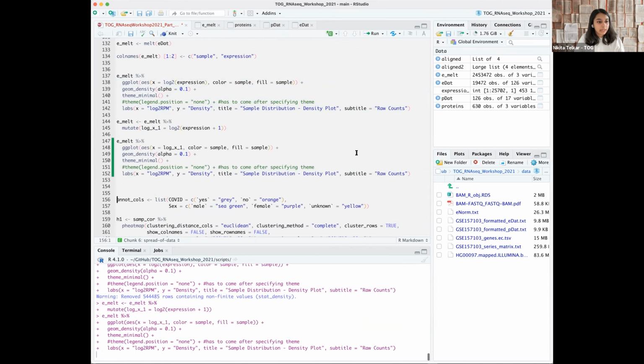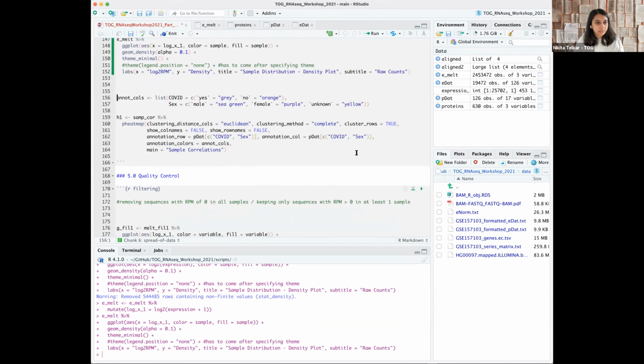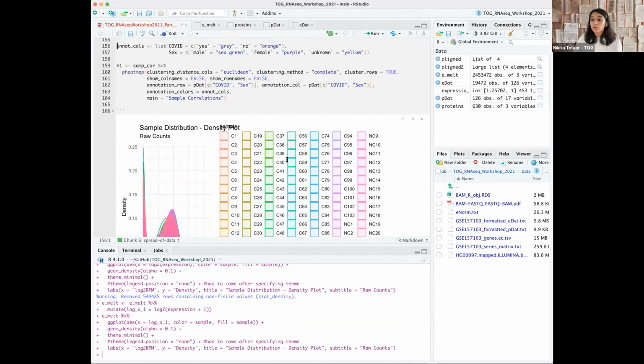Okay, and you do that. I think it's something with the way that it's coded. It doesn't usually give that. Yeah, so we got no warning, right? So that means that it's working. So everything's been shifted by 1.